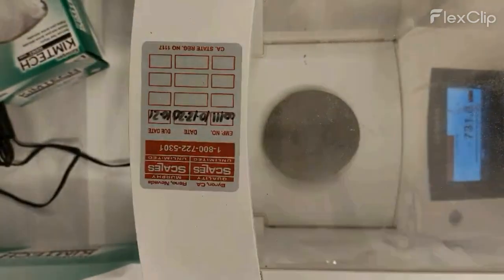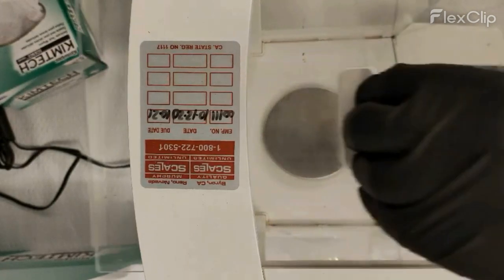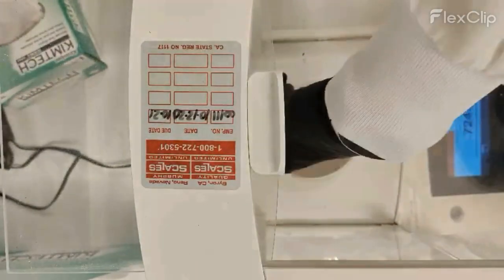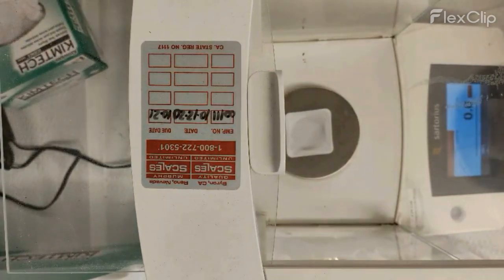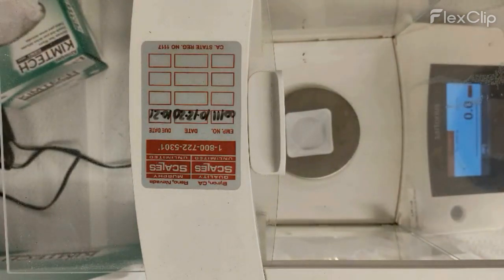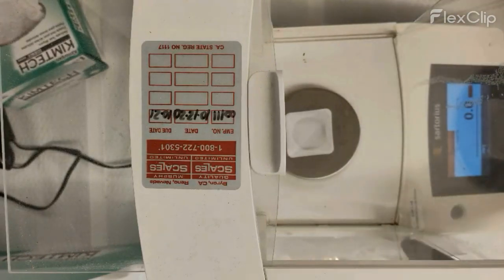Next, I gather all the necessary materials for my experiment. This lab is state of the art, and I'm learning so much every day. All the materials that I've gathered, I have to weigh with this machine right here, as you see. Now, I need it to be very accurate in my measurements and the use of precise instruments. That is why I'm going very slow.